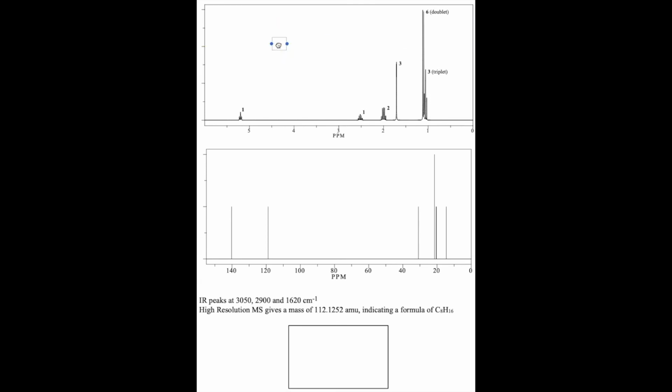All right, so let me go ahead and put together my rather dumb-looking alkene with 1 H on it, okay? And again, notice how I'm putting extra bonds around because I know that that alkene must go on to 4 things, though they don't have to be different. So in this case, I know one of those 4 things attached to that alkene is the hydrogen. I know that because that's what that peak at 5.2 is telling me. I have a vinyl hydrogen, right on an alkene. And it integrates for 1, so I know there's only 1 there.